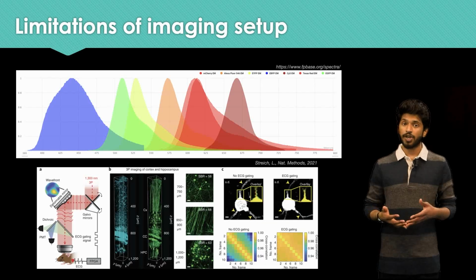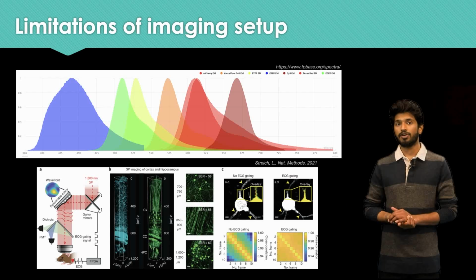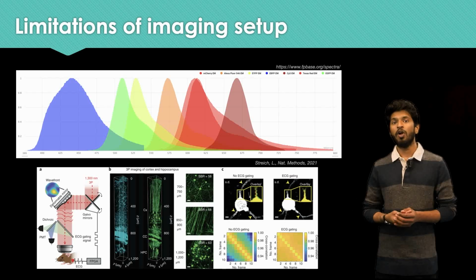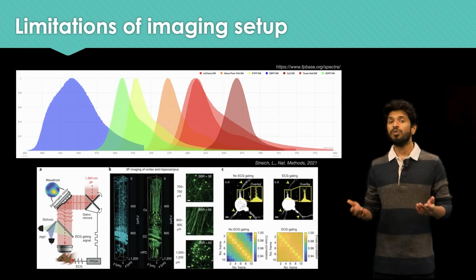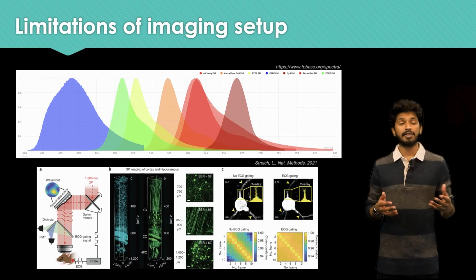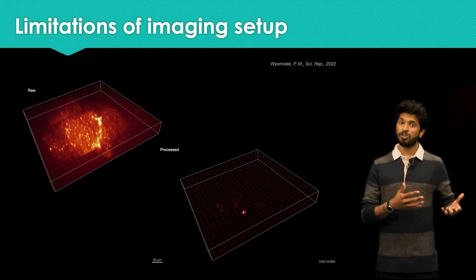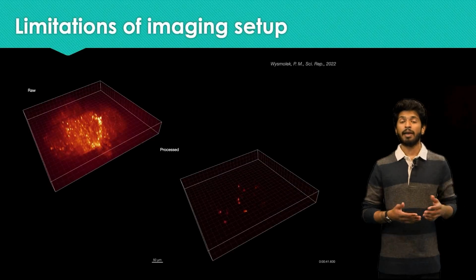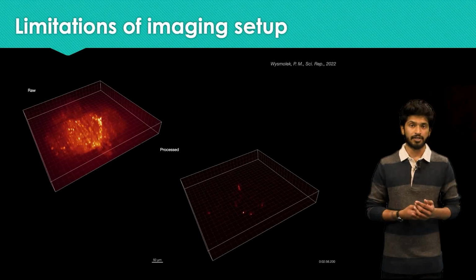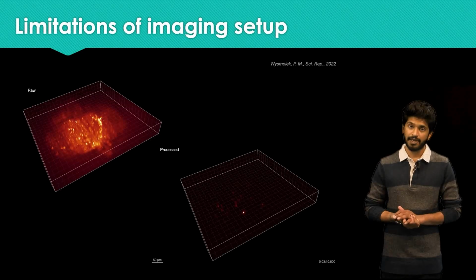If a greater depth is required, you could try to use a different microscopy technique like multiphoton microscopy to understand if it might be better for your sample and the event you're observing. Although multiphoton microscopy has its own disadvantages, with the need to validate different fluorophores separately and understand their excitation wavelength under that setup. Speed might also be required with your imaging event, especially if you're looking at immune cell movements, calcium signaling, or neural signaling. For this, there are advantages in light sheet and the spinning disk microscopy.